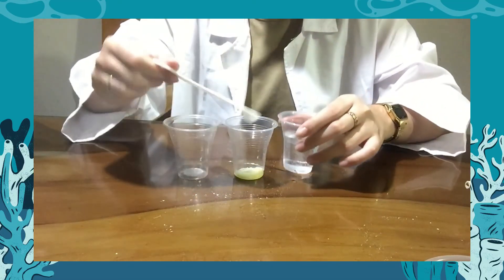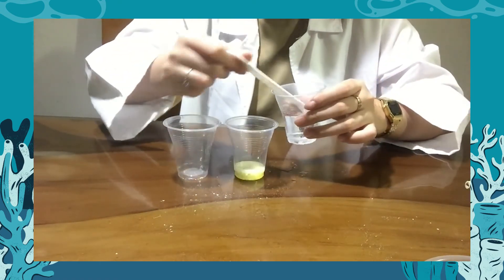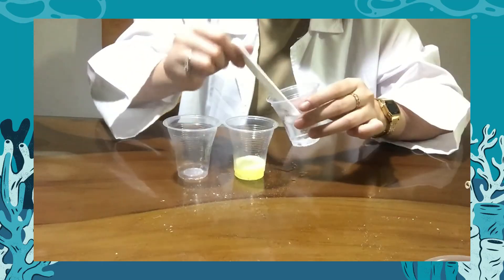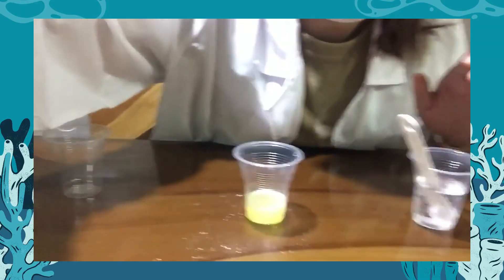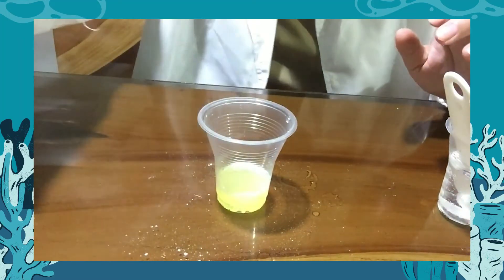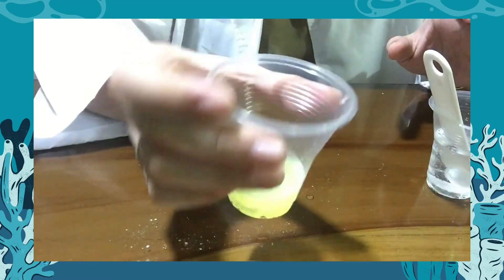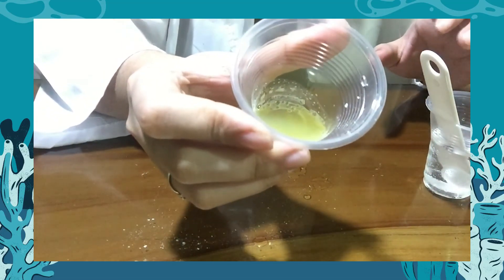Now let's add 10 milliliters of water and see if there will be a chemical reaction this time. After adding the water, we can see bubbles forming. There was a chemical reaction between the water, sodium bicarbonate, and citric acid.